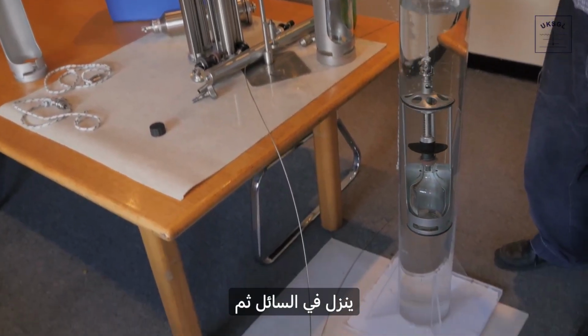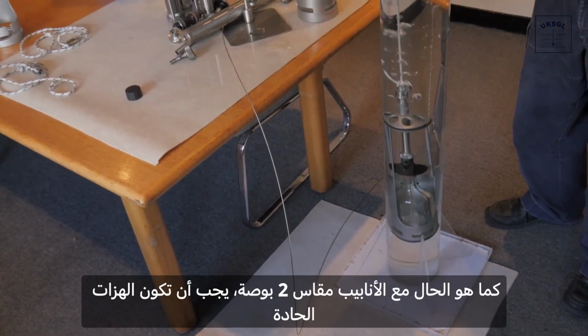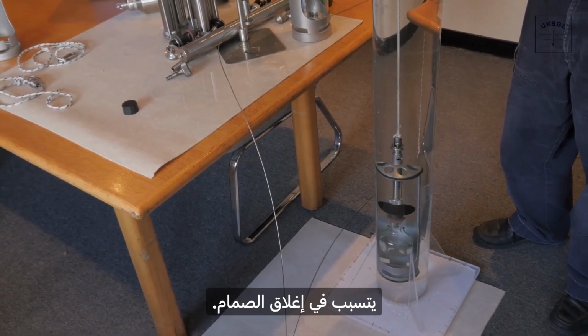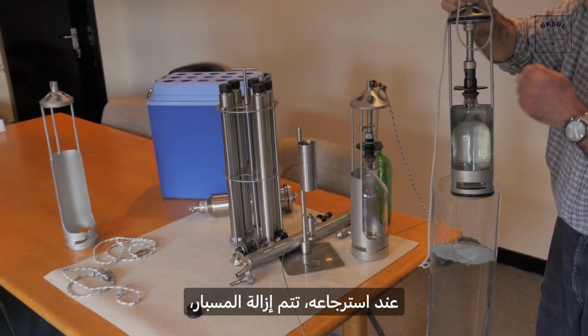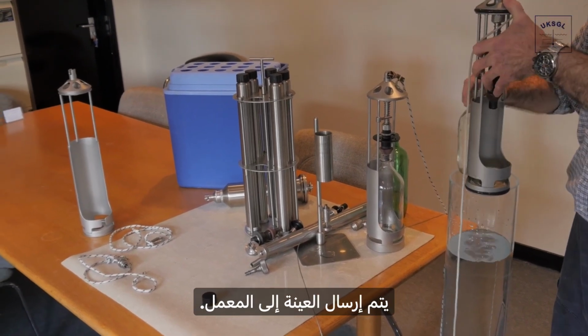It is lowered into the liquid, then gently raised to begin filling. As with the 2-inch tubes, sharp jerks must be avoided, as this will cause the valve to close. Upon retrieval, the probe is removed, the bottle is capped, and the sample is sent off to the lab.